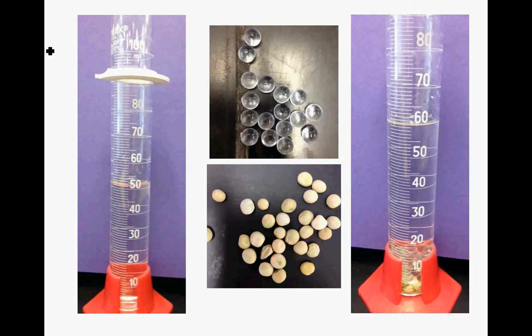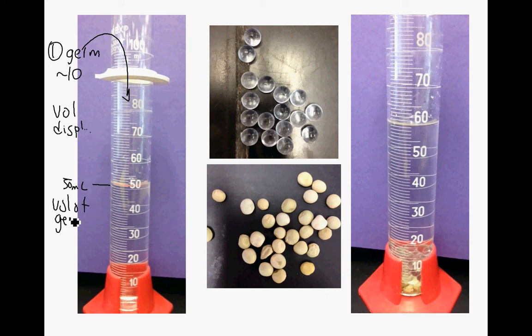Then you're going to use the graduated cylinders, and you need to know the volume of your germinated seeds and your non-germinated seeds. I don't have a picture of germinated seeds at the moment, but you're going to use the germinated seeds first. I'm thinking we're going to use around 10 germinated seeds. You're going to put those into this graduated cylinder, which I filled to about 50 mLs. We're going to use a volume displacement method to figure out the volume of those germinated seeds. Then you're going to take those seeds out, dump the water out, and dump the germinated seeds out gently. The volume of the germinated seeds is what you need to know.